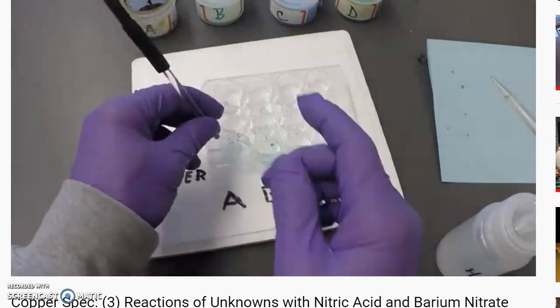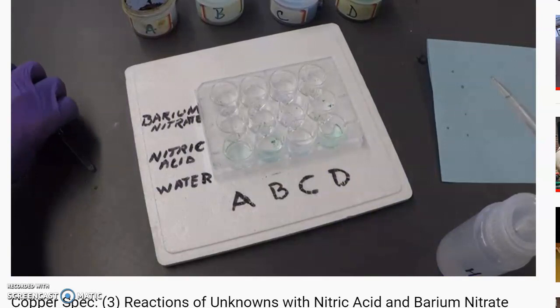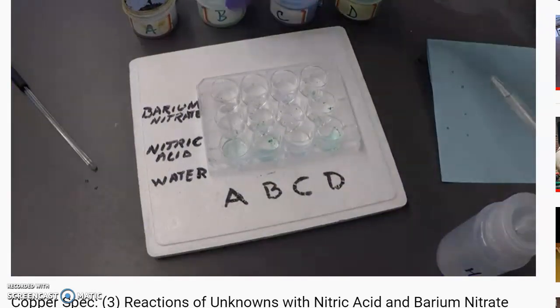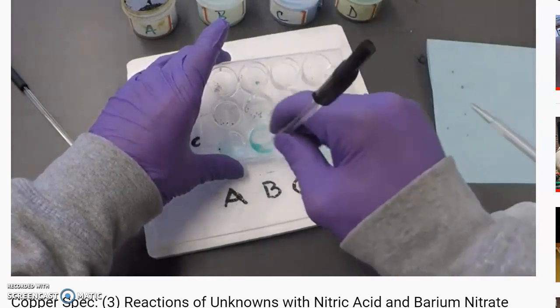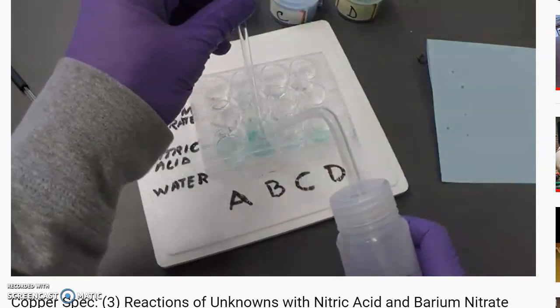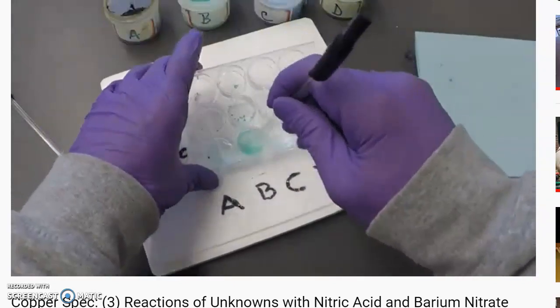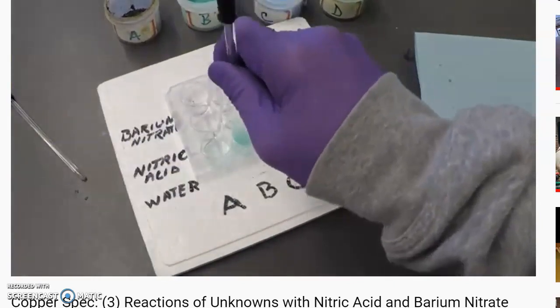It might look reasonably homogeneous when you mix it, but if you let it settle out, if it doesn't dissolve, then it will still be cloudy and it'll kind of settle out to the bottom. And at the end, we're really going to be able to see the results of all of these.